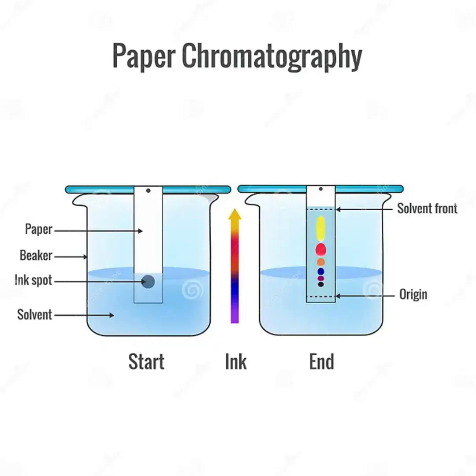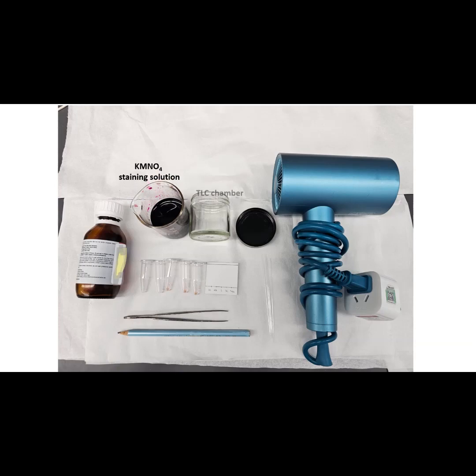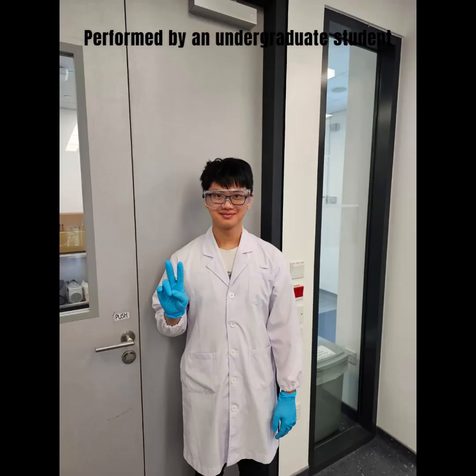To do this, we would require the following materials: potassium permanganate staining solution, a TLC chamber, some cough syrup, different samples for analysis, a TLC plate, forceps, a pencil, capillaries, and a hairdryer. Demonstration of this TLC procedure is performed by our final year undergraduate student, Julian.